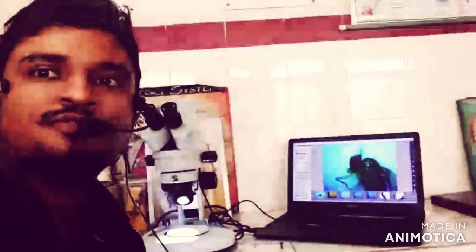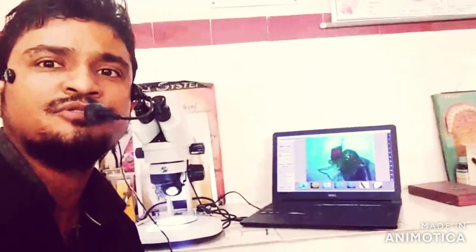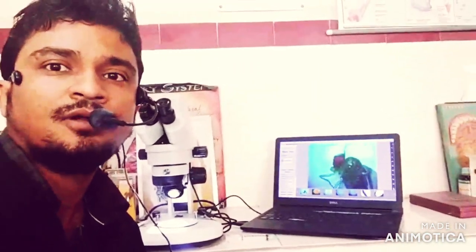You need to focus on the different parts of the Drosophila. You can see the main feature is that you can distinguish it by seeing the red eyes, though they have different mutants and variations like orange, vermillion, white eyes. So let's see what it looks like.